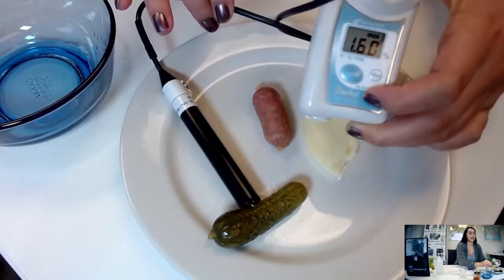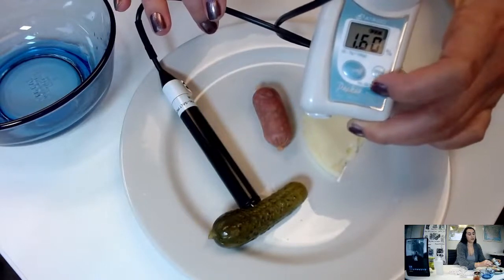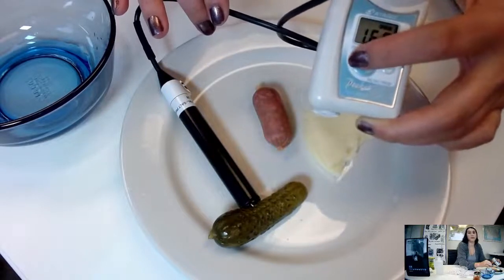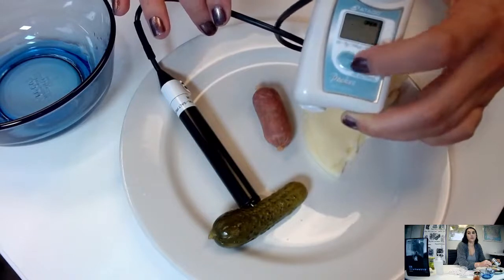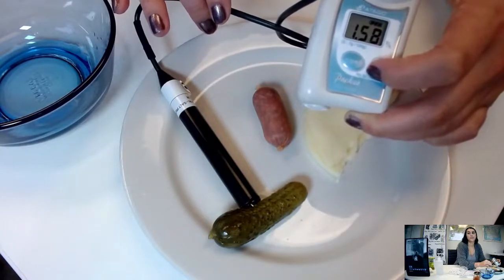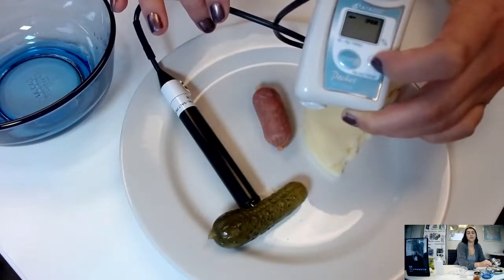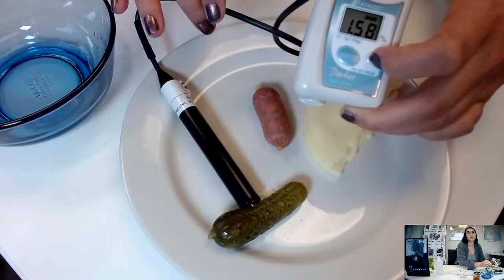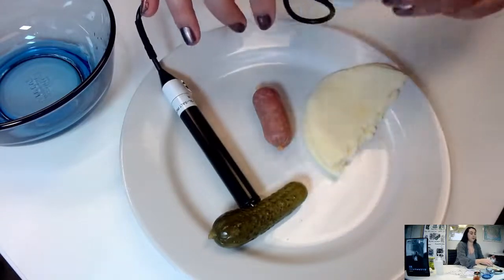Right, and because this pickle was in that brine solution, it was a little bit cold, so we can wait a couple of seconds just to let it acclimate a little bit. Okay. Press it a couple more times to get it stable. Okay, perfect. All right, so that was the pickle.